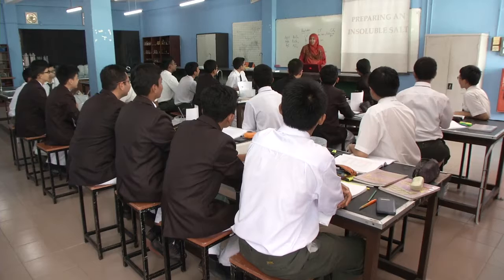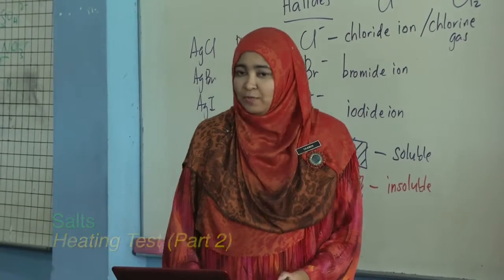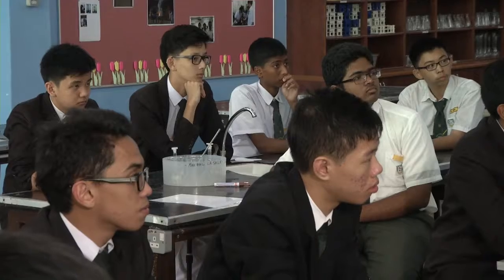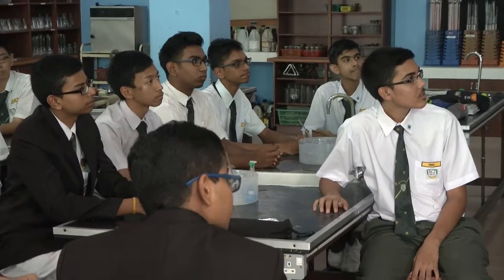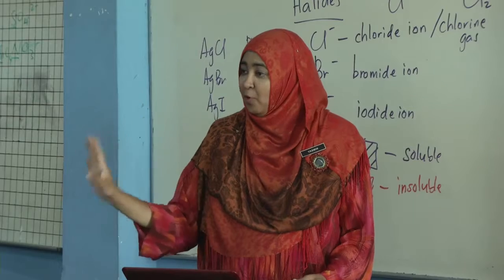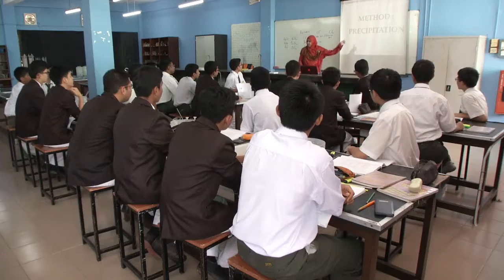Okay, now that you have identified the insoluble salts, we are now to prepare the insoluble salt. If you can see on your table, in the basin, the lab assistant has already prepared 2 solutions in a volumetric flask for you to carry out the experiments later. But before you can carry out the experiment, you need to know the method. What is the method?